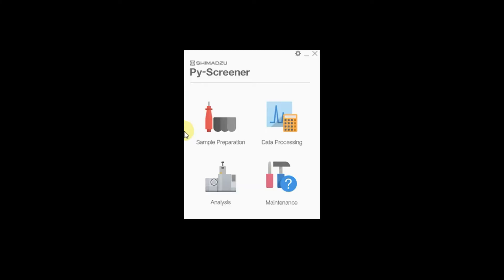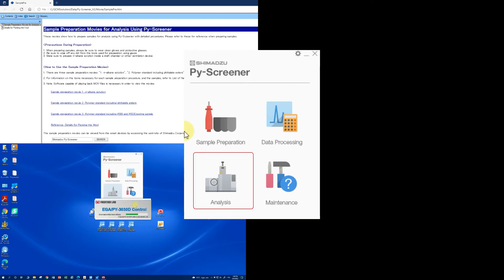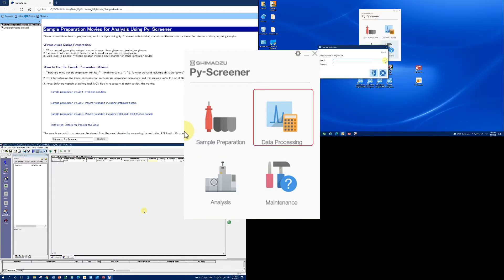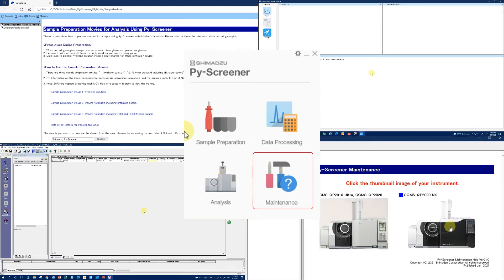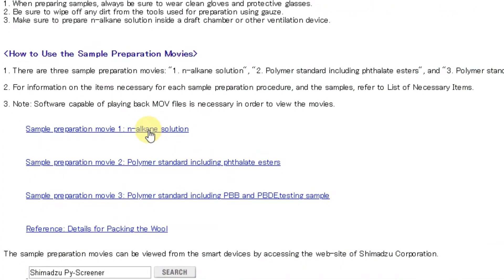Shimadzu can provide instruments like a pyrolyzer with GC-MS for screening of these three groups of compounds. To ease the user workload from setting up the method from scratch, Shimadzu had developed a program called PY Screener, which consists of ready methods, workflow documents, and software to analyze and process your sample results. With PY Screener, even a non-analytical background user can prepare the sample and start sample analysis without facing any difficulties. PY Screener simplifies the process of analyzing phthalate esters and brominated flame retardant compounds. Clicking the sample preparation icon loads a page with videos on how to prepare samples. The analysis icon loads all required software to run samples. For data processing, it loads the correct software to check your results. The maintenance icon loads a page showing the steps for system maintenance.